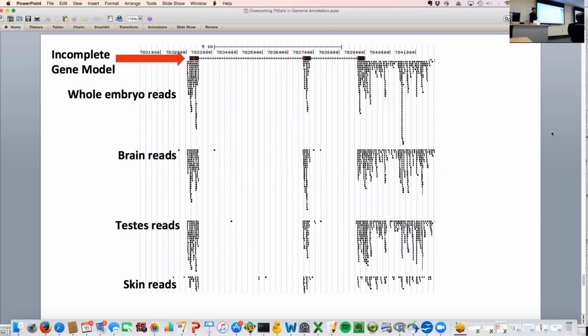Yeah, including everything I've ever done. We don't look at that. We don't have those UTRs in. Those reads that fall outside of the current gene models for zebra finch, most people don't do anything with those. So you throw away a chunk of your data that's totally useful. Totally useful. And especially, again, for these feather keratin genes, many of the exonic reads are going to get thrown away, because you can't confidently say which of your keratins they came from.